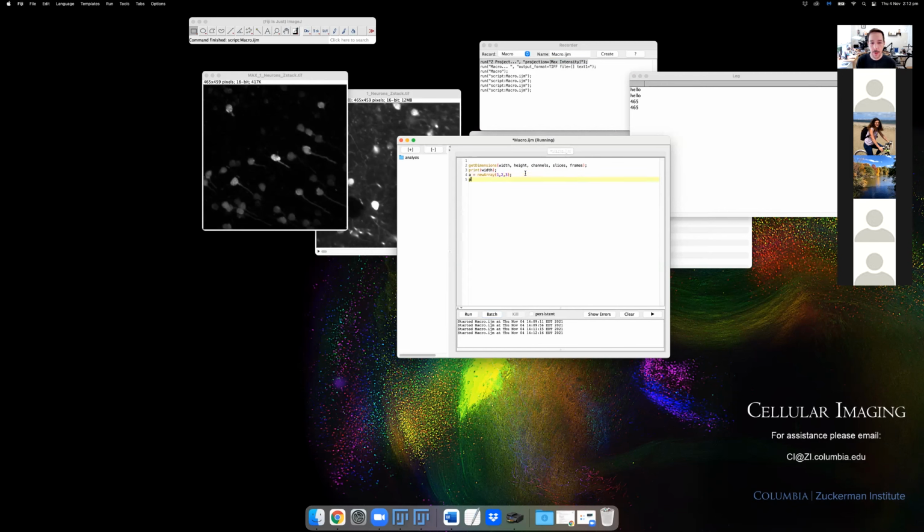So if we have a new array, now I should be able to say print A. And if it's an array, we can select which sort of value or element in that array. So if I wanted to print the first value here, which would be 1, this can be a little bit confusing if you're just starting this. We sort of work from 0 up. So the first value or element in these arrays will be 0.